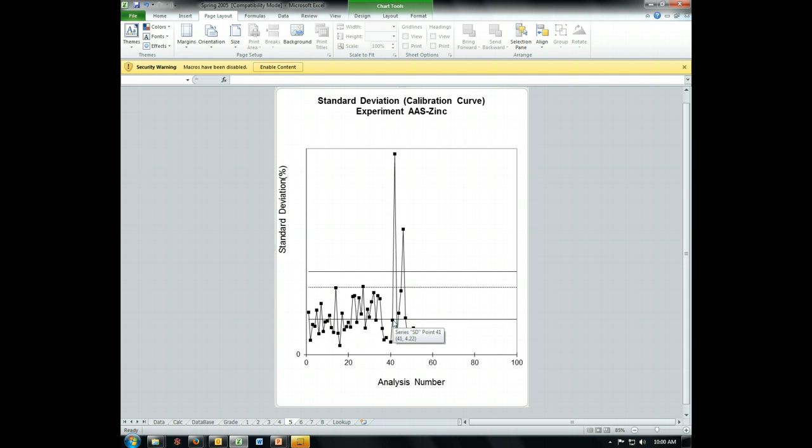Now if we look at the standard deviations, they should also stay within a fairly reproducible limit. If you have a sudden increase in the scatter of your values, that's a strong sign that something dramatically wrong just happened. And look at that, 24% error for the standard deviation. That assay is garbage and is a cause to shut down. Same with this one, cause to shut down. The rest of these are staying below the warning level, and it looks like it's a random enough pattern that none of those other 6 criteria have been met.